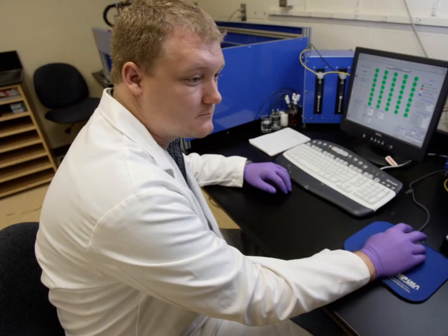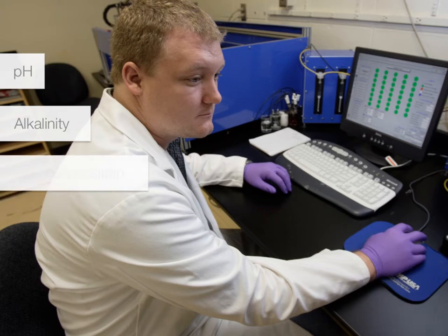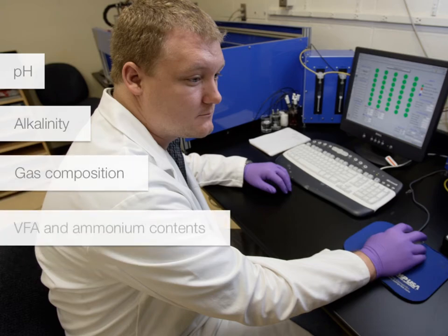Gas production is not the only parameter analyzed here. pH, alkalinity, gas composition, VFA, and ammonium contents are also measured. Those parameters give you a better understanding of the process and indicate how various changes may affect its performance.